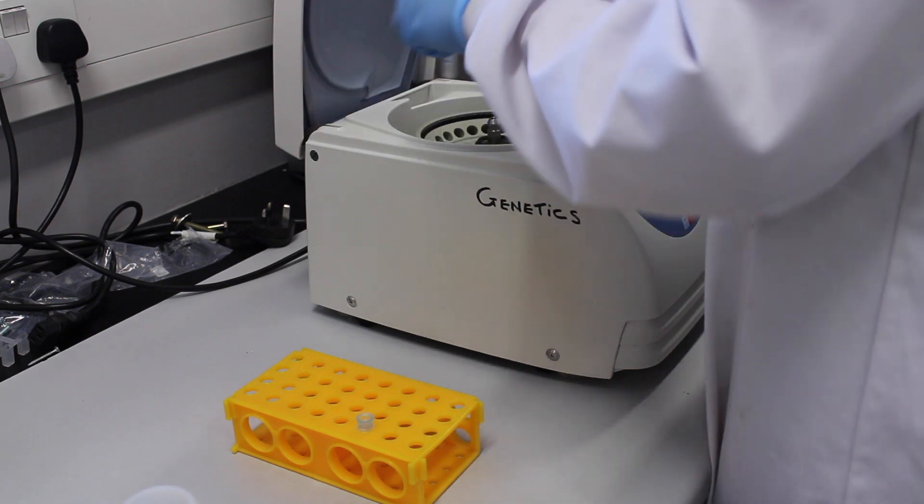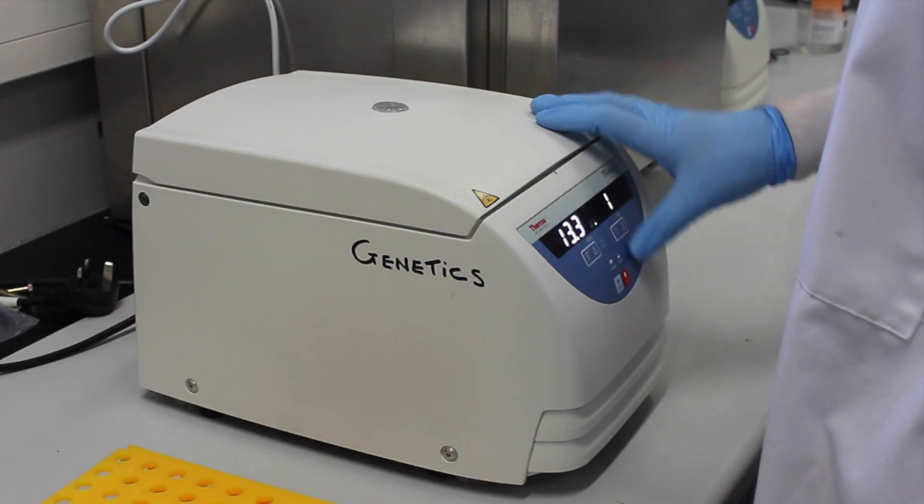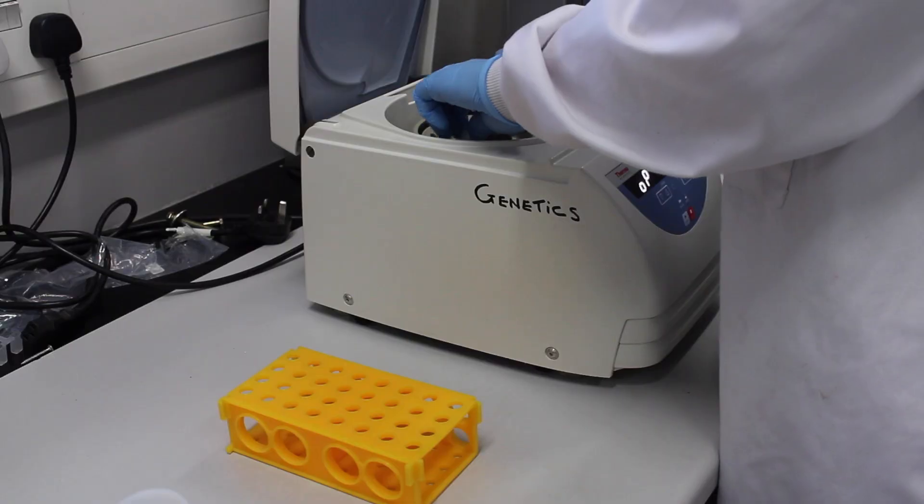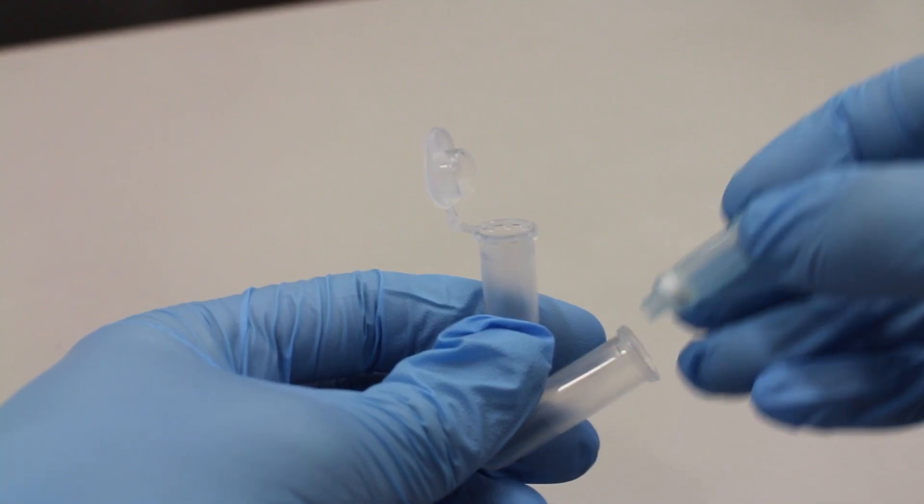The columns are again centrifuged at top speed for 1 minute. The columns are then transferred into empty Eppendorf tubes.